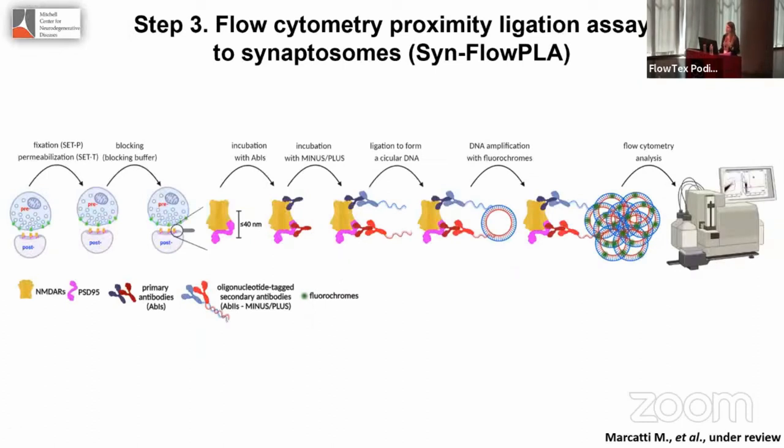About the PLA, proximity ligation assay, for those of you who are not familiar with it, it's a very important and kind of simple tool, even if it takes basically all day to perform, but it gives us very good results. It is a technique that is able to detect interaction between proteins that are close enough to emit this signal.